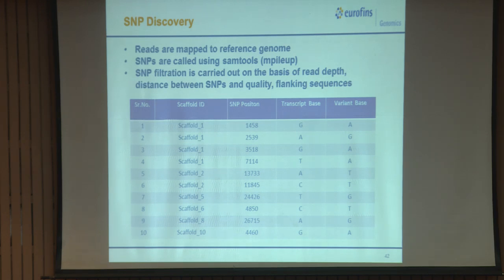Using IGV, we can visualize base by base whether the tool has called the SNP correctly or not. And these SNPs will also have a quality score with the confidence with which they have been called. For example, if I have 10 reads mapping at that region and only 2 reads say that it is T and the rest of the reads say reference.